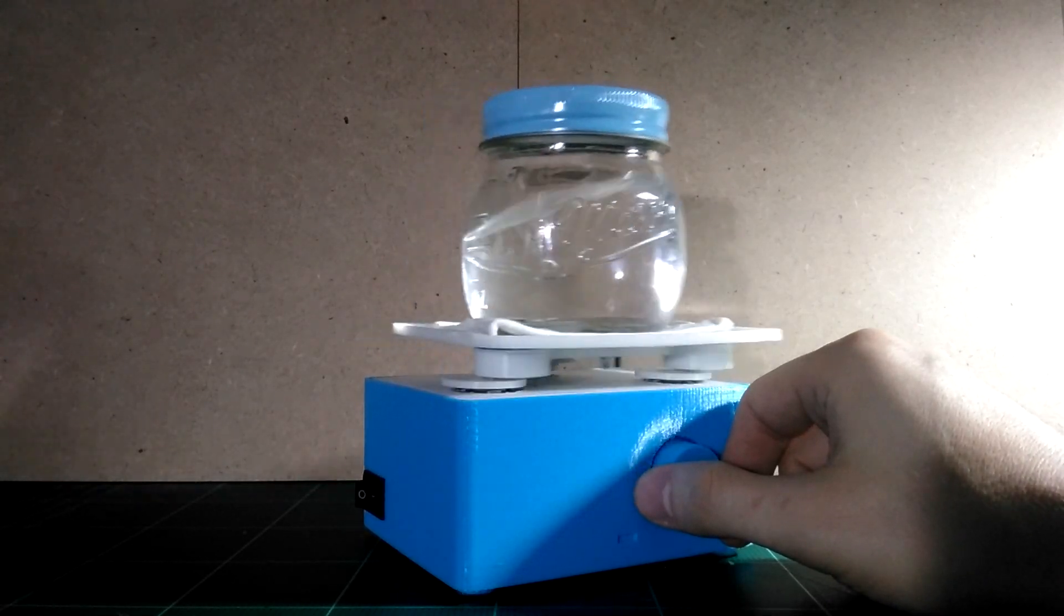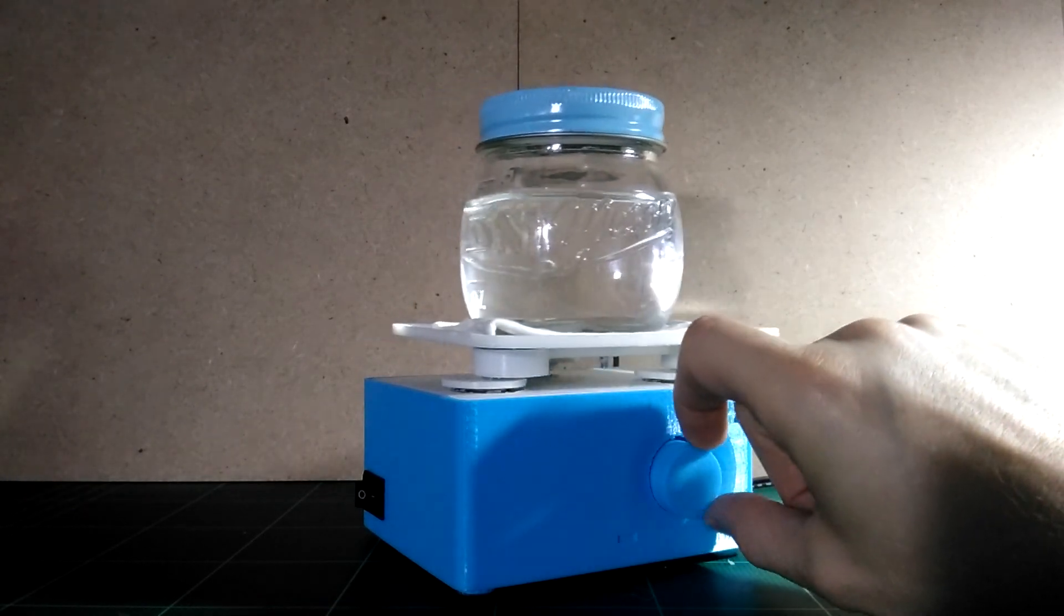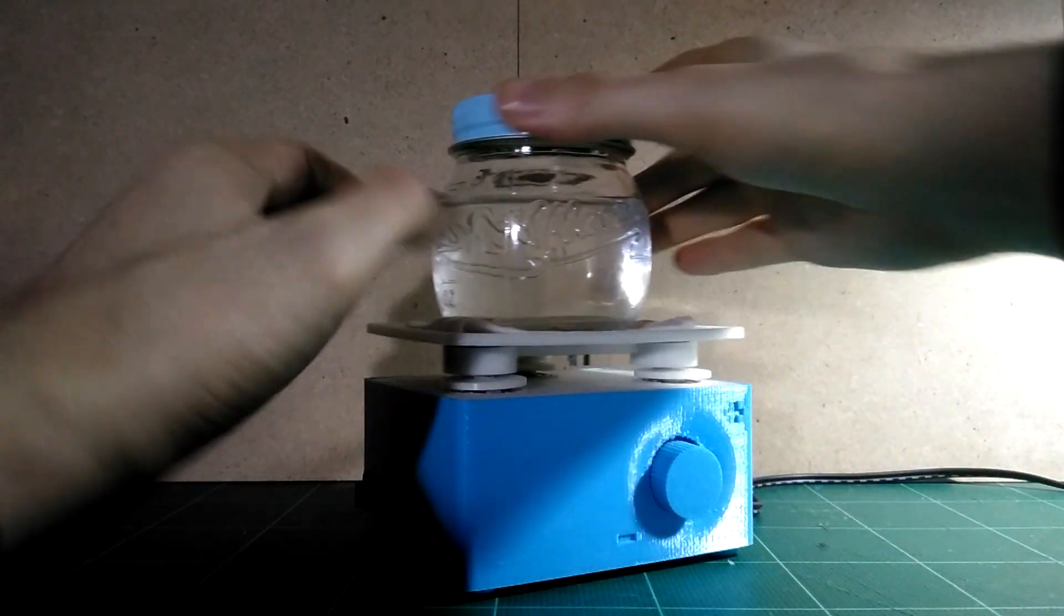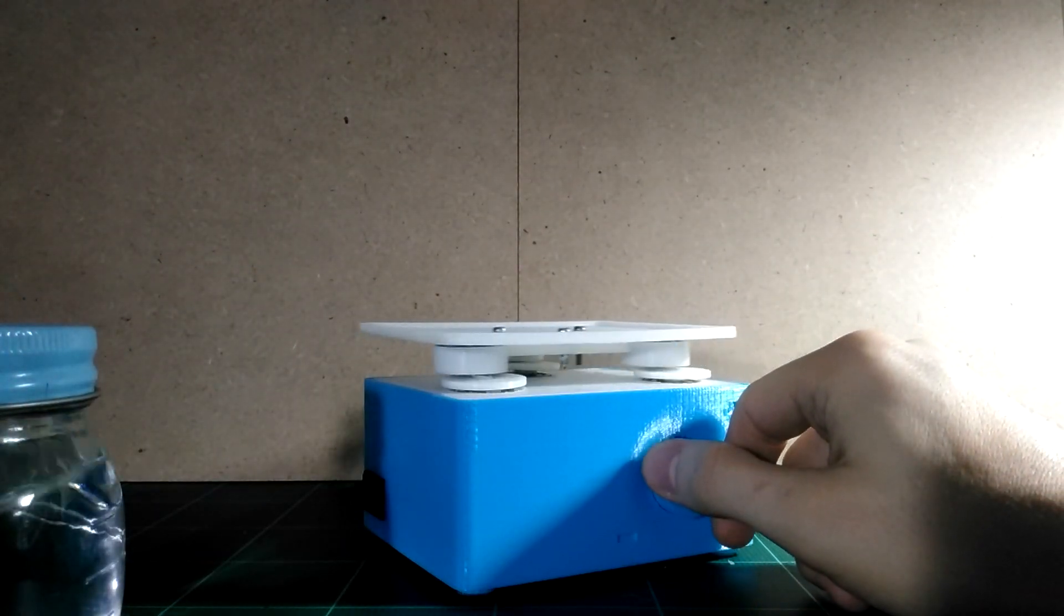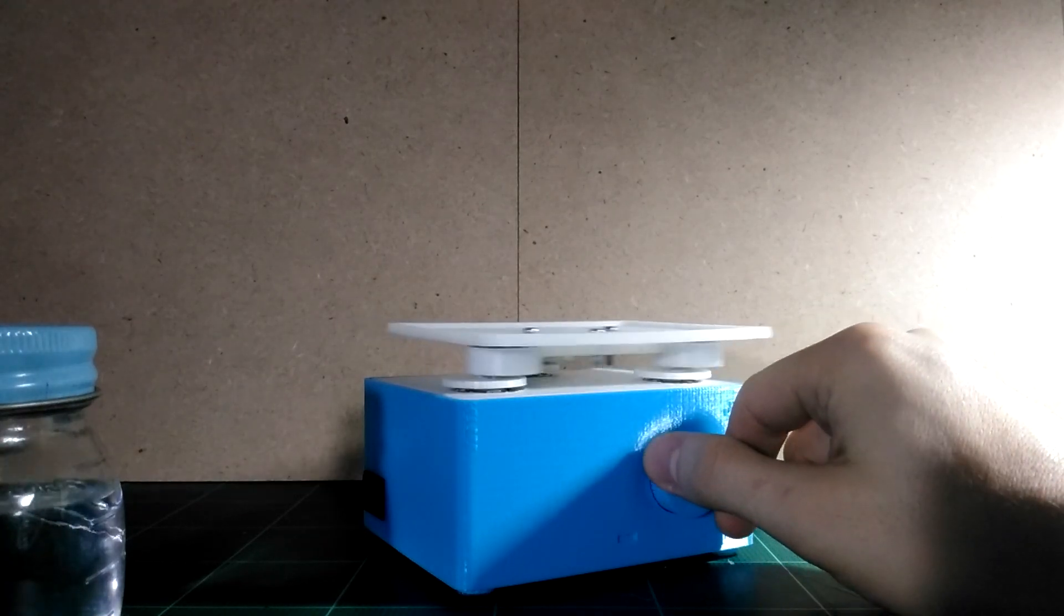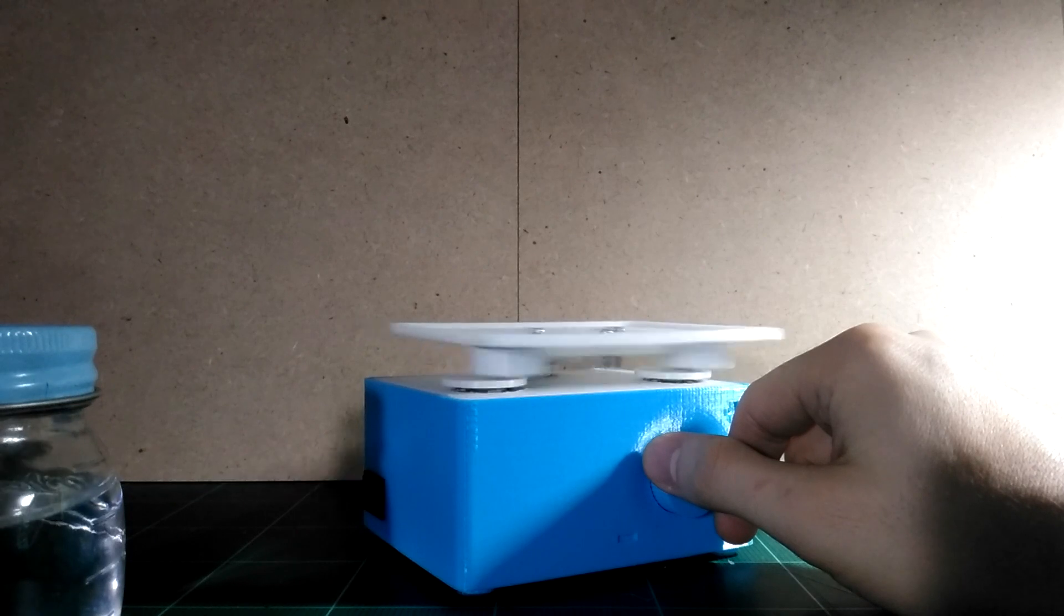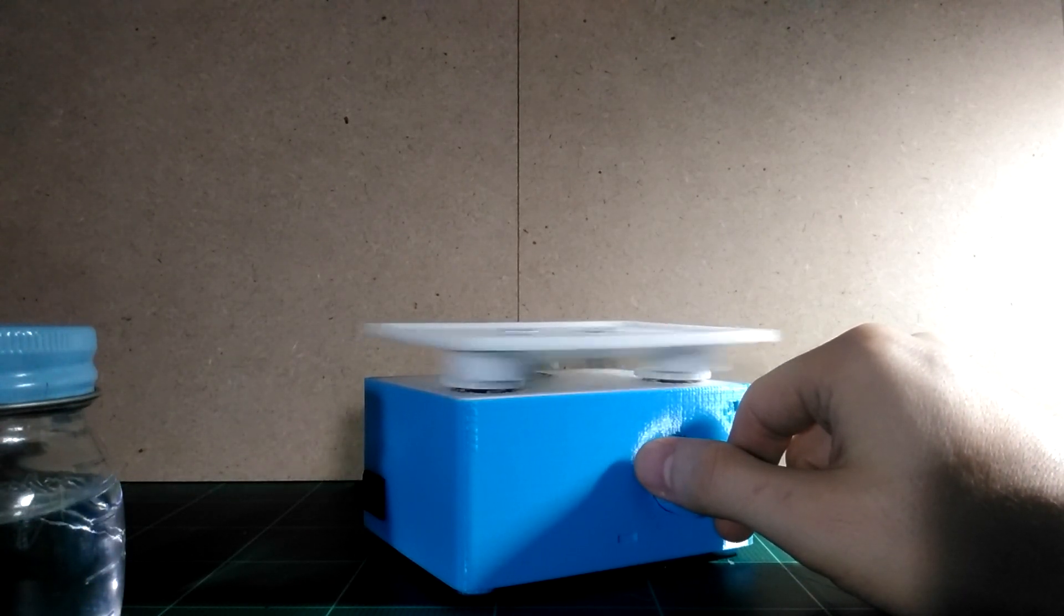I'll take the jar off so you can see how fast it really can get going. This is about as fast as it goes.